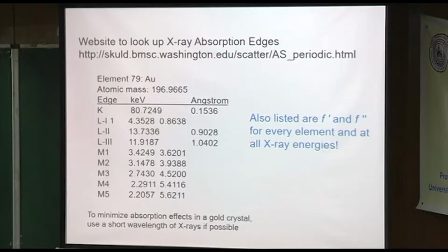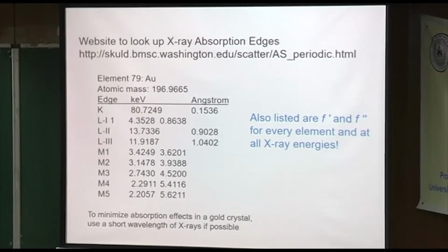The nice thing about a synchrotron, though, if you ever get a chance to use one, is that you can dial the wavelength that you want. You're not restricted to just molybdenum or copper. Usually you can go down to about 0.6 angstroms X-ray wavelength, and go as high as a little more than copper, maybe 1.7 angstroms, and every way in between. So it's very useful.